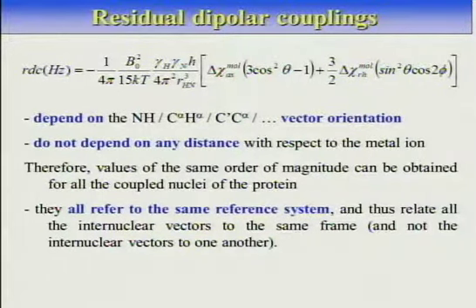The difference with respect to before is that now the residual dipolar coupling that you are measuring is no longer dependent on the anisotropy of motion, the D parameter that was in the former presentation, but it's actually depending on the magnetic susceptibility of the system, which, if you do your measurements properly, by subtracting, as you remember, oriented versus non-oriented couplings, you measure this residual dipolar interaction.